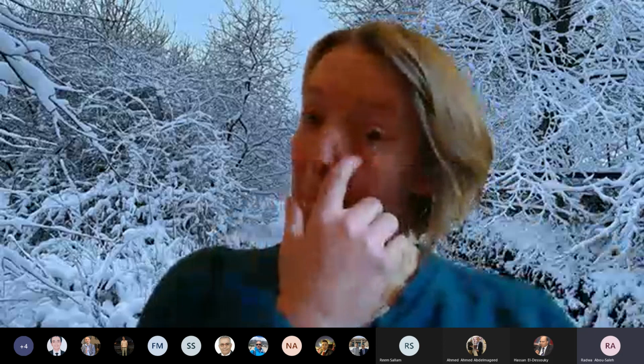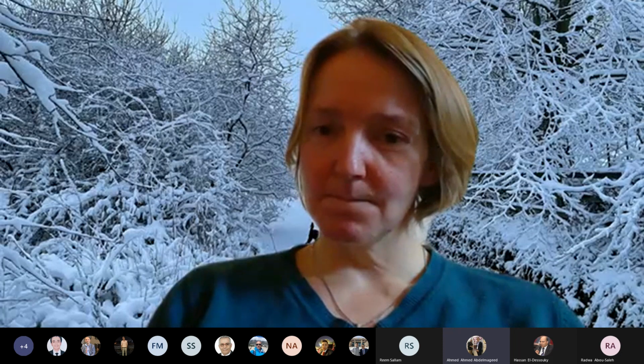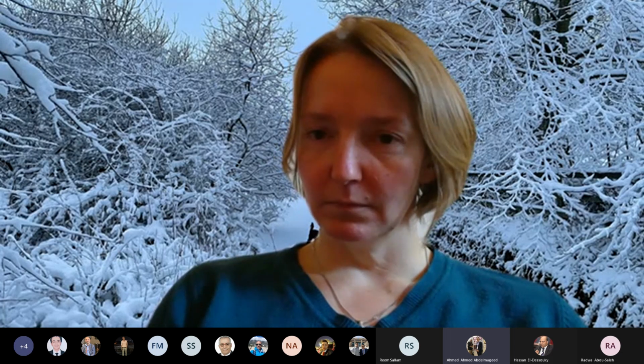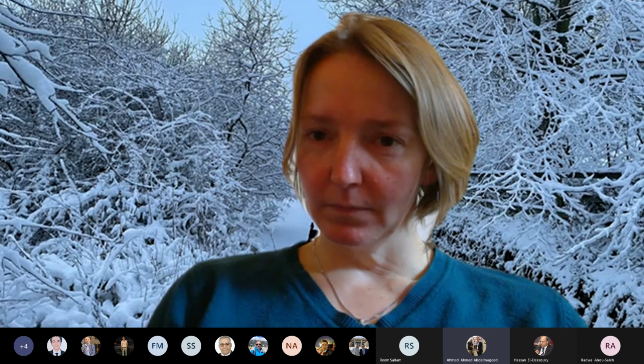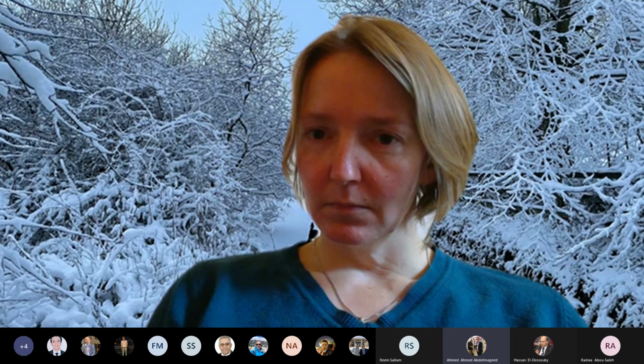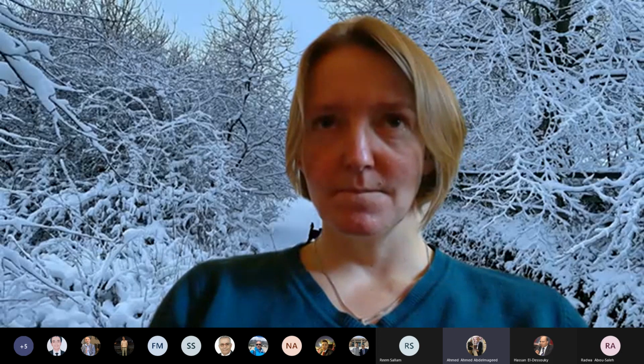Now we have Dr. Ahmed, would you like to ask your question? There you go. Yeah, thanks, Dr. Radwa, and thanks, Dr. Saleh, for the nice talk. It was really very interesting. Even though I'm not a specialist in microfluidics, the applications are very interesting, especially the one related to mixing liquids together to form, for example, some emulsions. This is actually a part of my major. My question is related to this arrangement of droplets. How did you avoid the coalescence between these droplets? This is the first one. And how about the large scale synthesis?